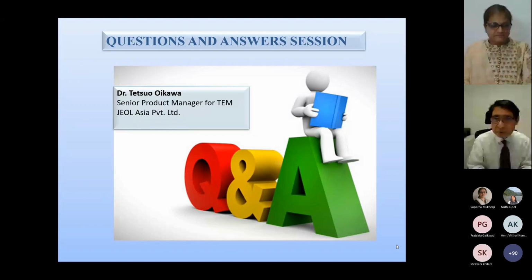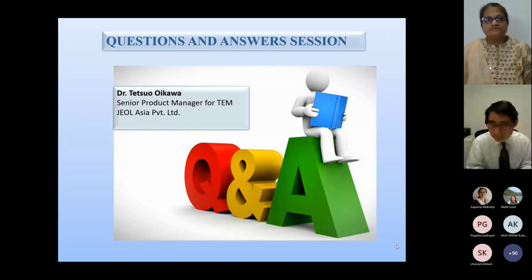Yeah, in this condition, with EDS analysis, we can get a carbon signal very clearly, and simultaneously we can observe another reference signal. We can make a quantification calculation. So we can clearly analyze the carbon concentration or another elemental concentration. Quantification by EDS is recommended.